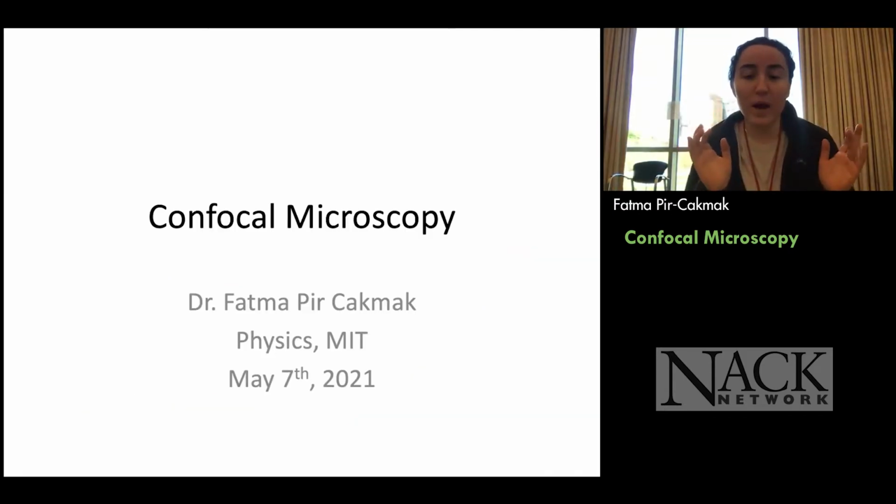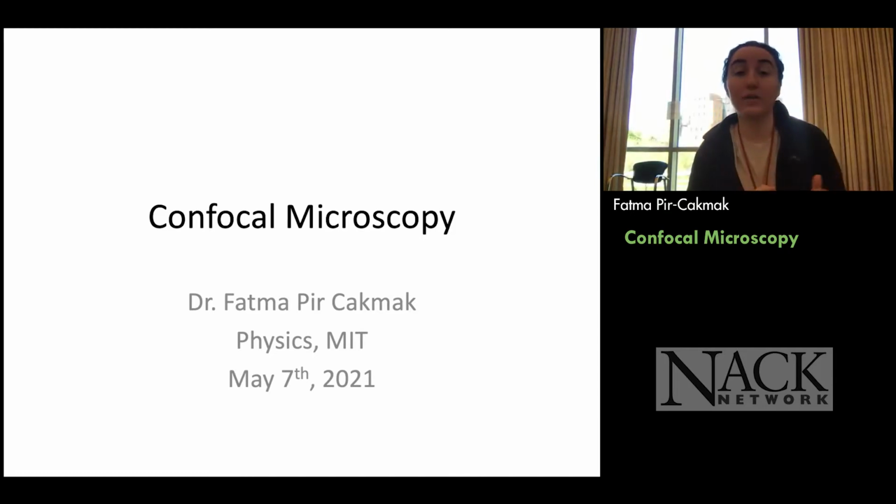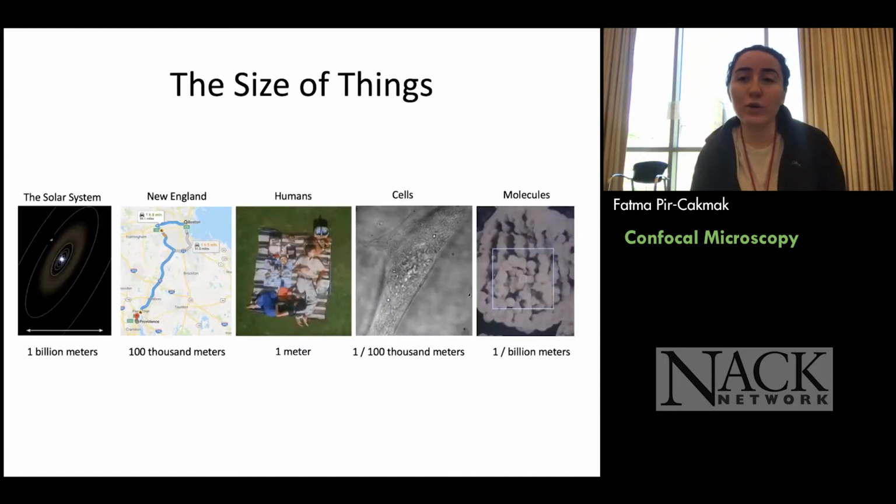So I'm going to talk about confocal microscope today and my research during my PhD, mostly at Penn State. But before going further into confocal microscopes, I want to talk about the size of the things we are looking at, right? Why do we need a microscope in the first place? Because the things we want to look at are quite small.